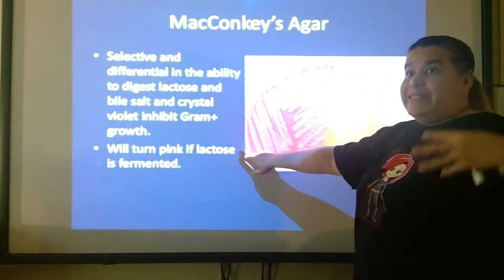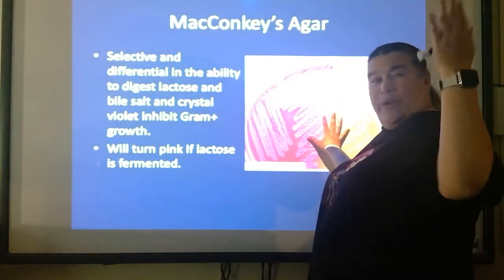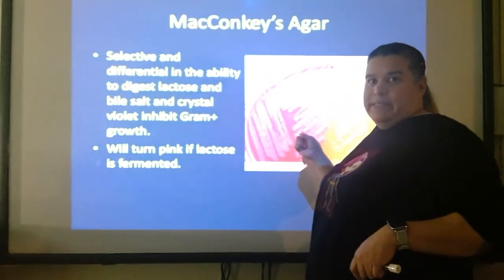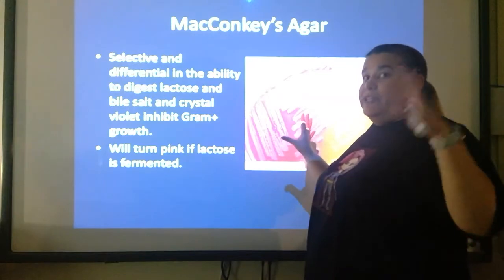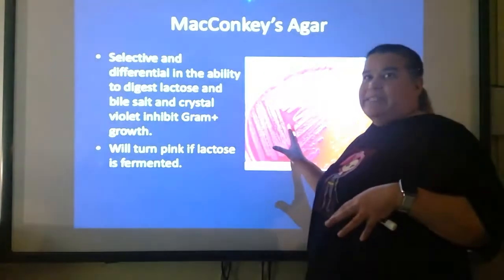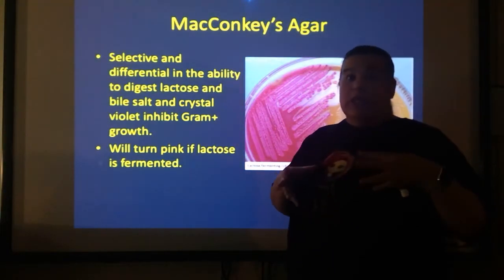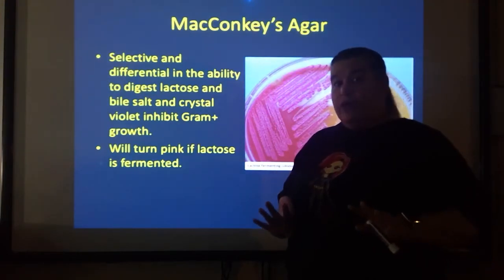So it's a characteristic of the bacteria that changes something on the agar that's a red flag for us to go, oh, this bacteria does this. Don't forget, every time we have a trait that is unique, it's something to add to the list of characteristics that give us an idea of what we're looking at as far as our 9 possible bacteria for our unknown.